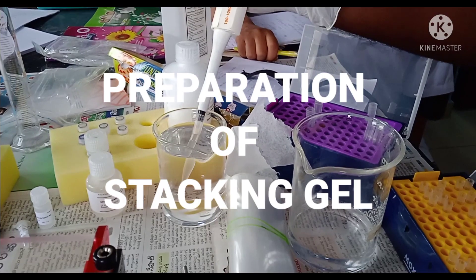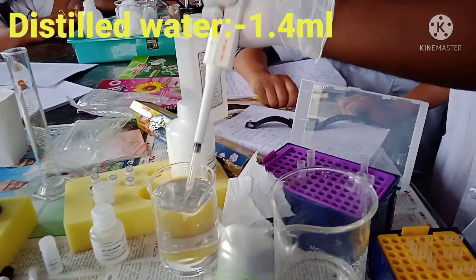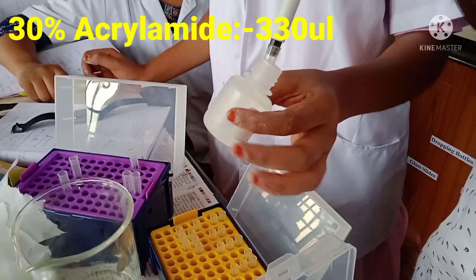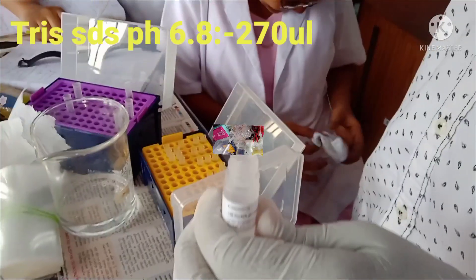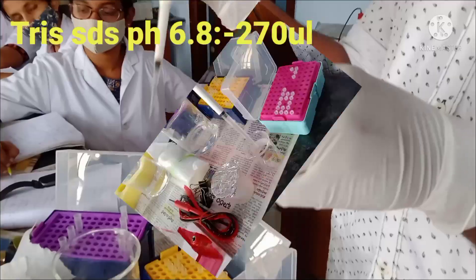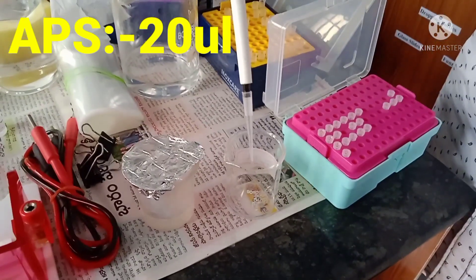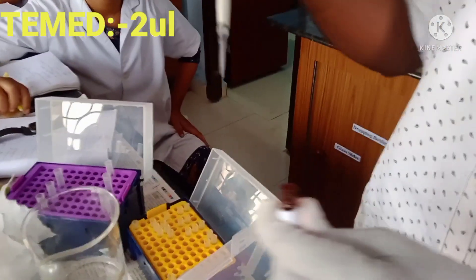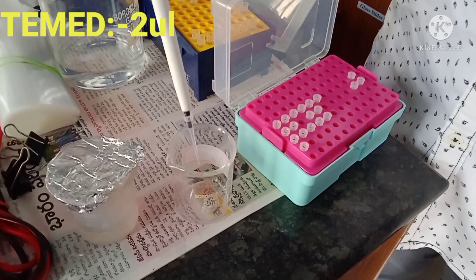Now let's prepare the stacking gel. For the stacking gel, take 1.4 ml of distilled water, then add 330 microliters of 30% acrylamide, followed by 270 microliters of Tris-SDS at pH 6.8. Then add 20 microliters of APS (ammonium persulfate). This composition gives 2 ml of stacking gel, which will be poured into the upper part of the vertical glass cassette.